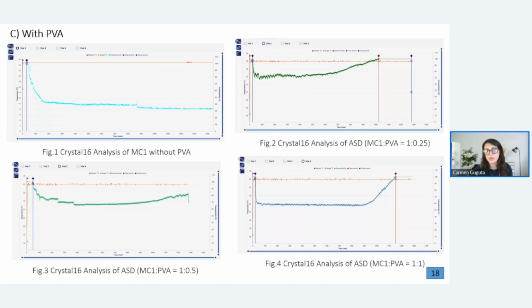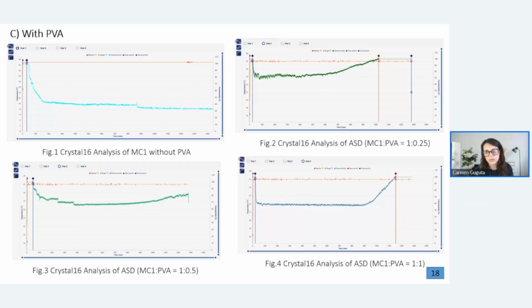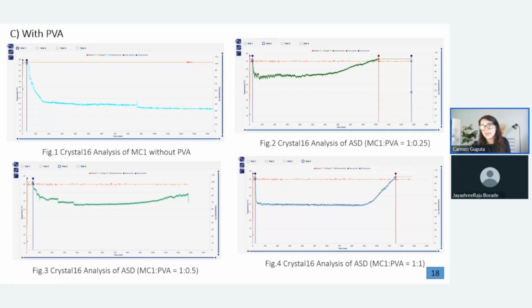And after salt formation, if you cannot make salts with that API, for example, you go through co-crystallization. And if co-crystallization also fails, at least in my experience in pharma, as a last resort you would use amorphous solid dispersion. But taking one step before that, co-crystallization.